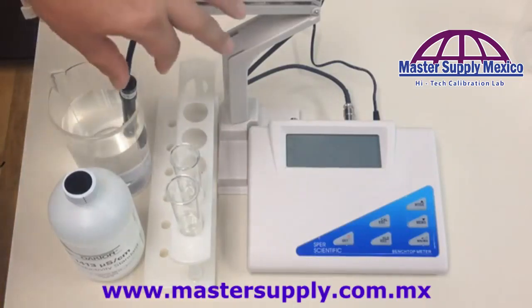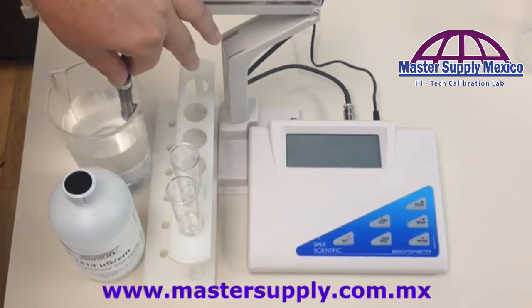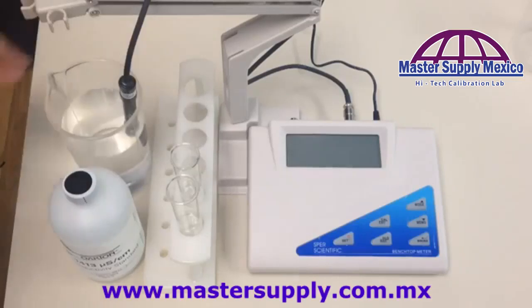The first thing you do after you get the unit, or if you haven't used the unit in a while, is make sure it sits in distilled water for at least 30 minutes. Our probe has been sitting in distilled water for at least 30 minutes. Also, every time you calibrate the unit, you must use fresh solution.